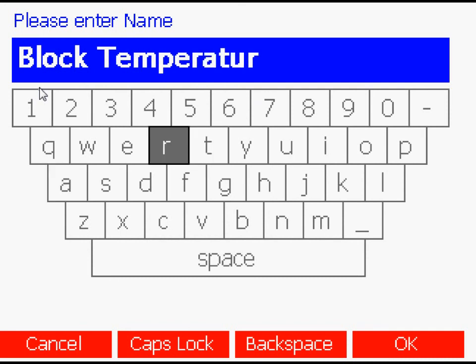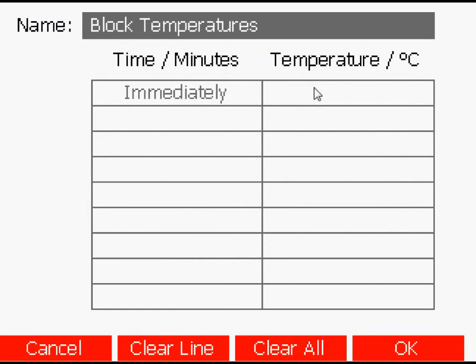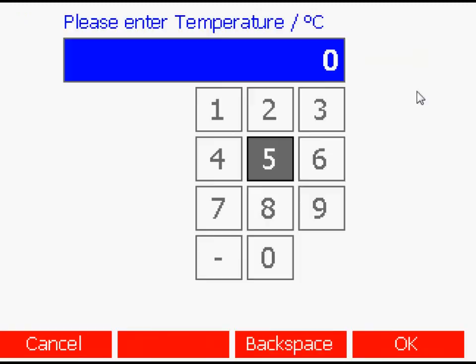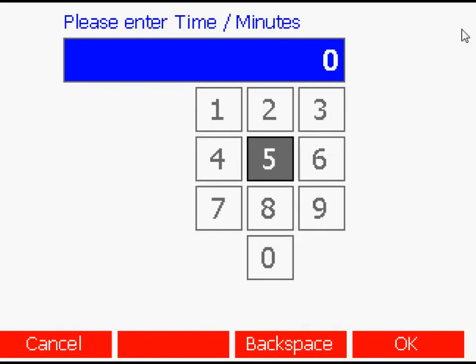Simply enter the required temperatures and times. This sequence can then be sent to a dry block connected via the communications interface.